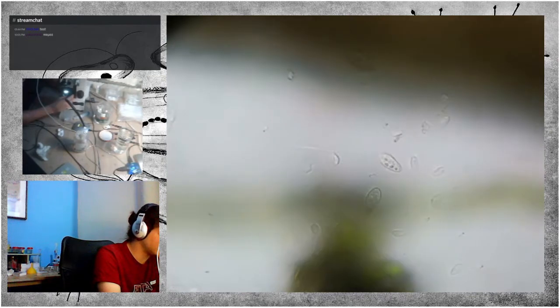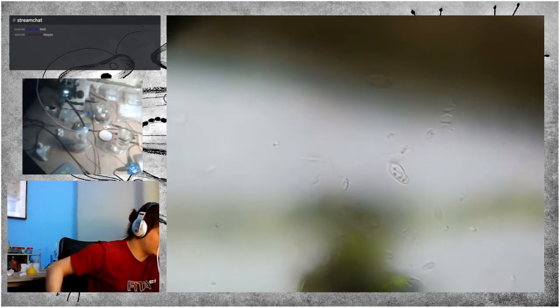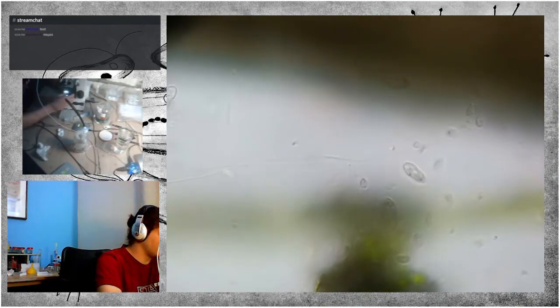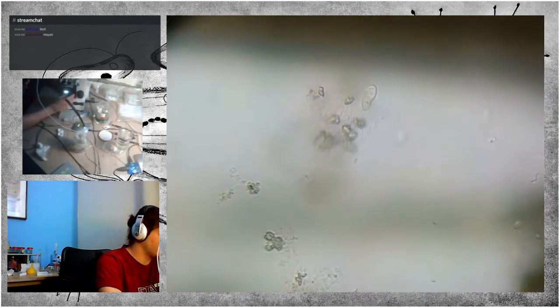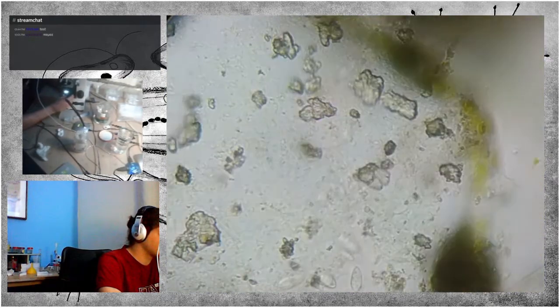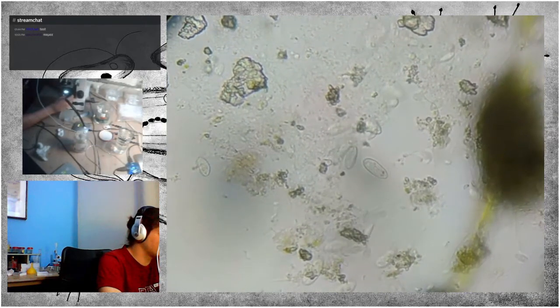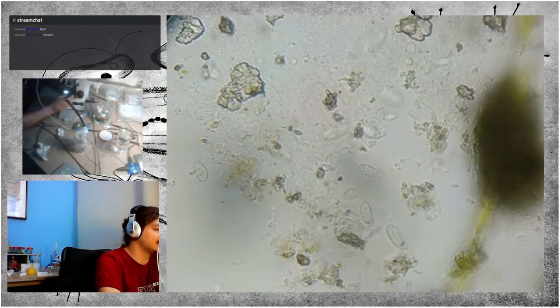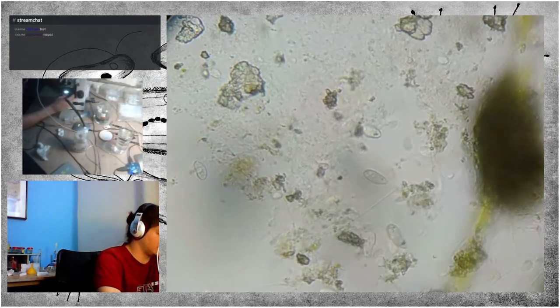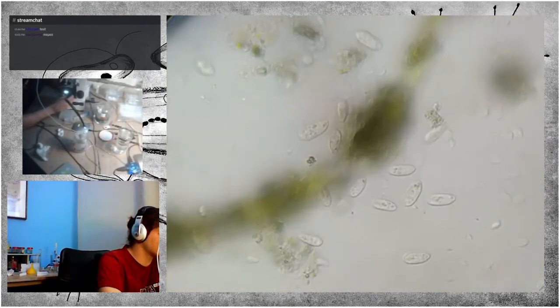And conjugation basically is the process where with sexual reproduction they manage to mitigate the genetic damage. Obviously, good mutations stay with them, and propagate through the generations, because they offer an advantage to the ciliates.